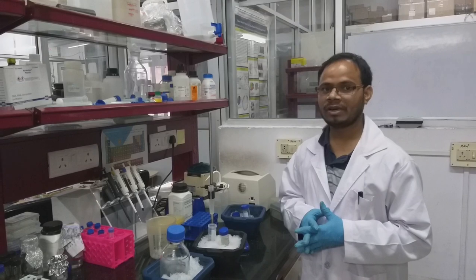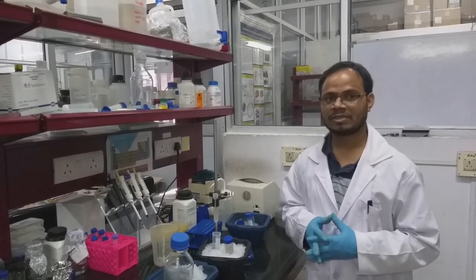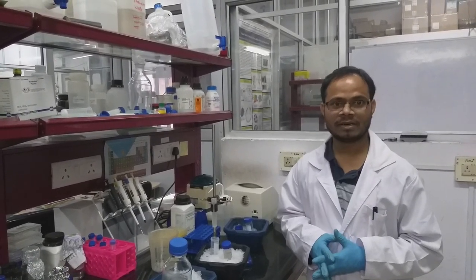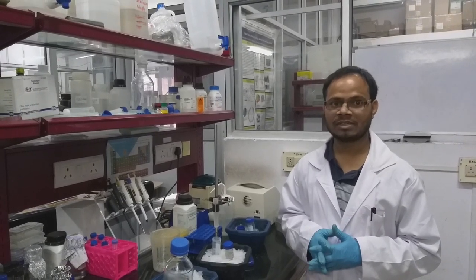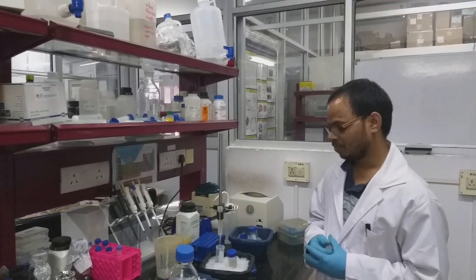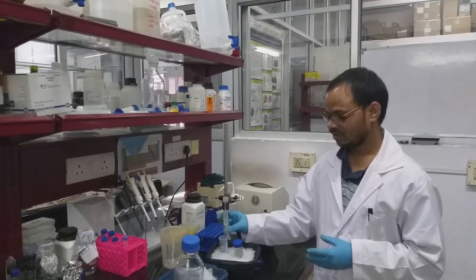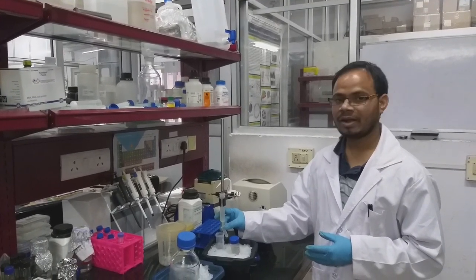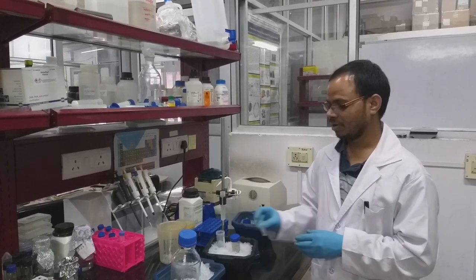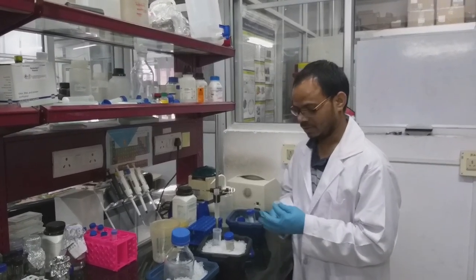Say you are getting only 10% of the protein in your purified fractions, and 90% of the protein is eluting in the flow through. In that case you can reuse the flow through for purifying the protein. So you have to collect the fractions in small microcentrifuge tubes, and we have to save those fractions, label them and save.